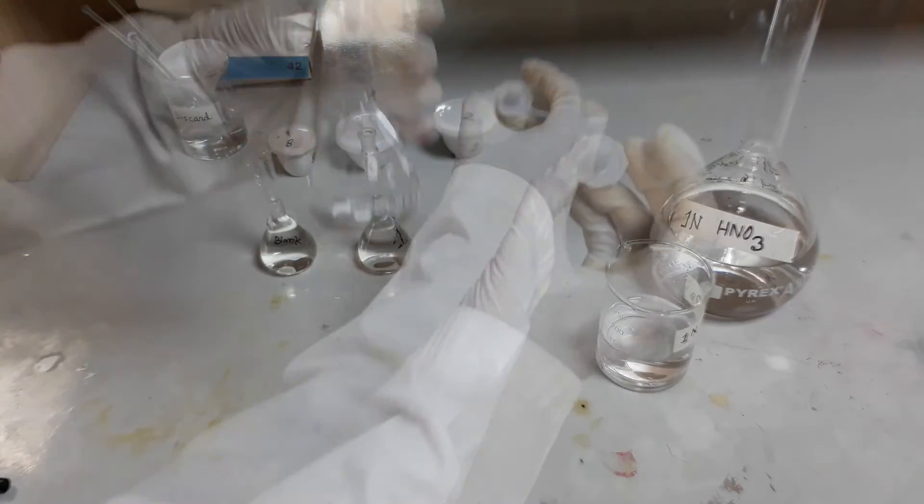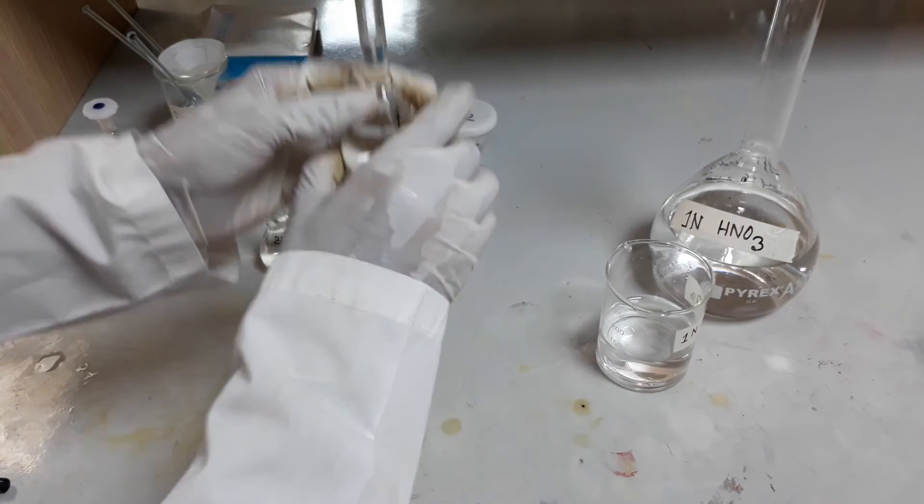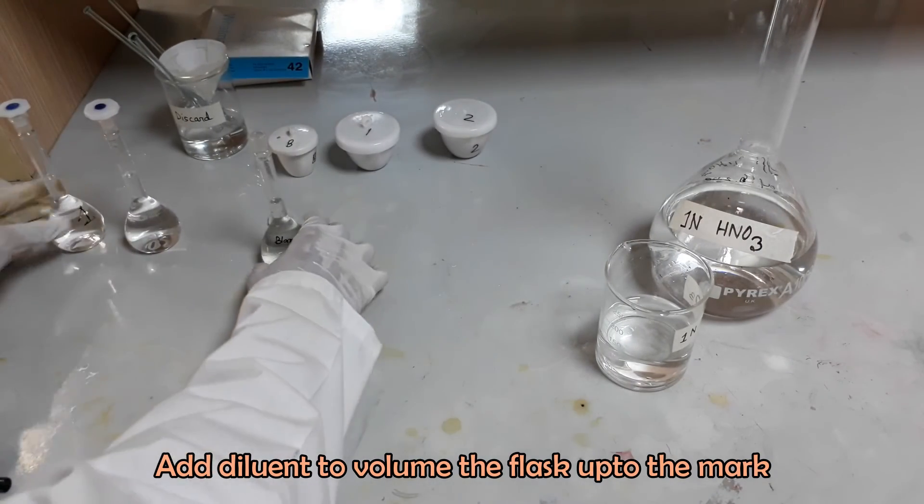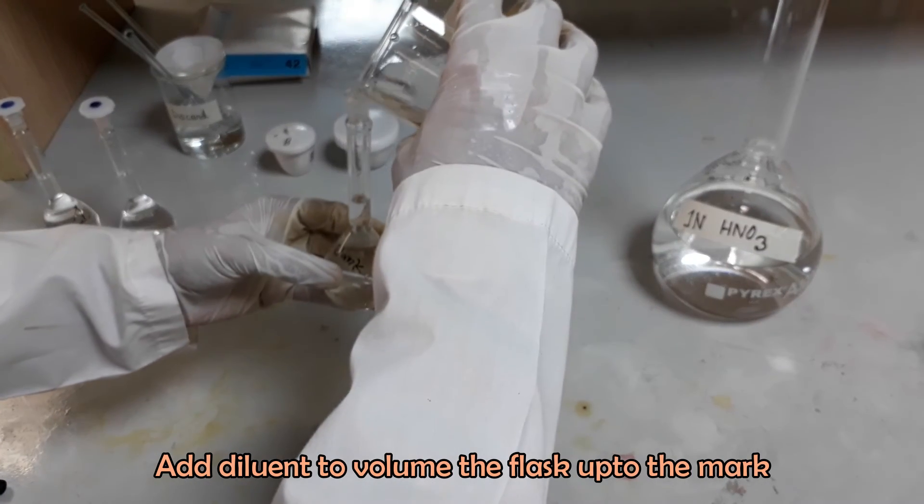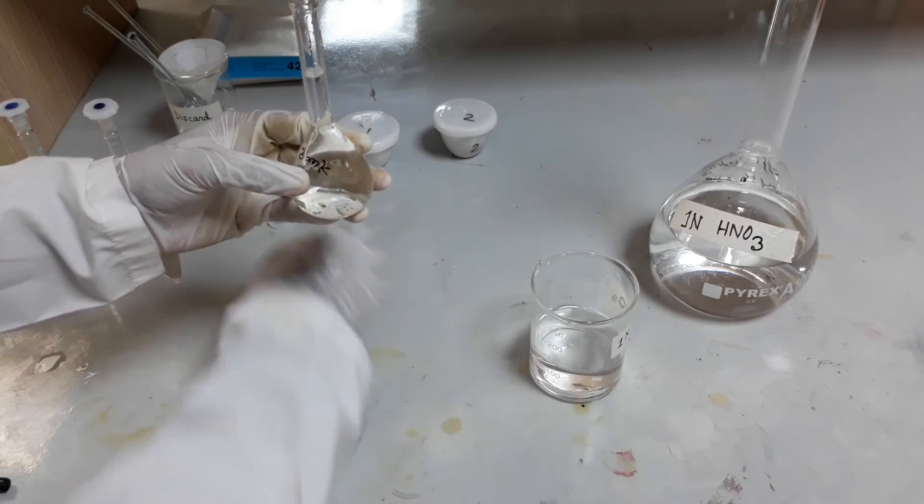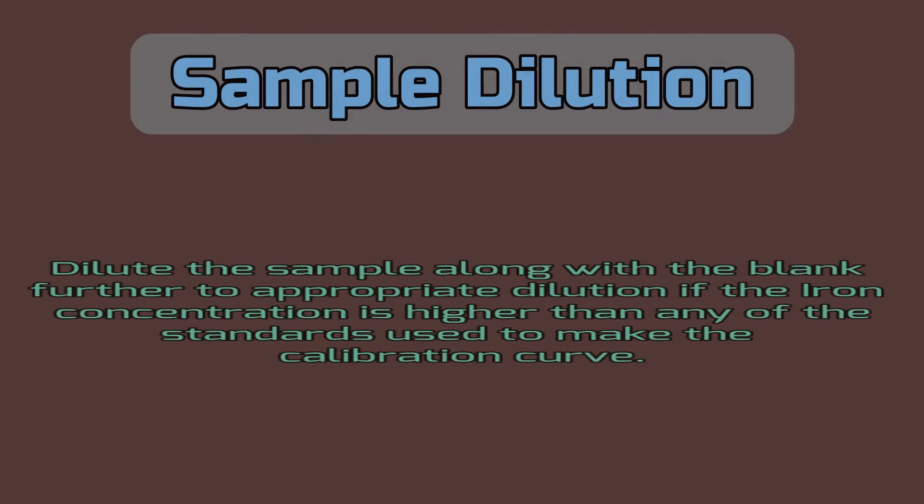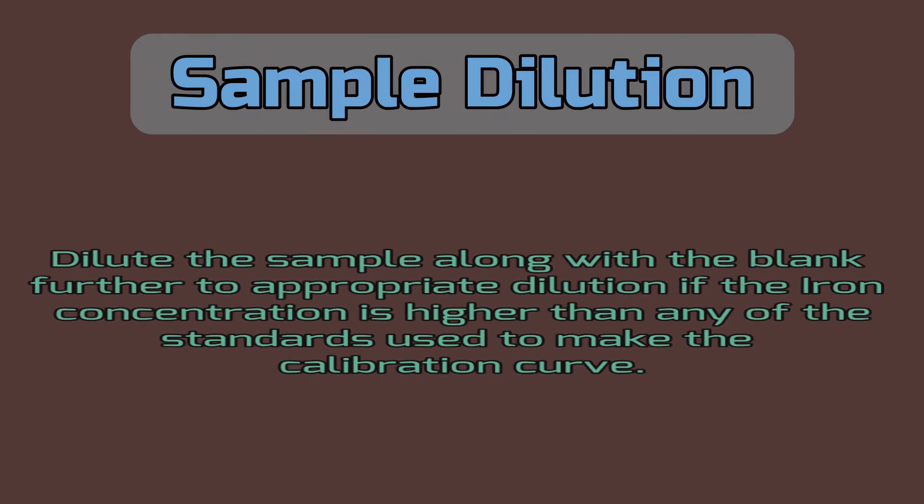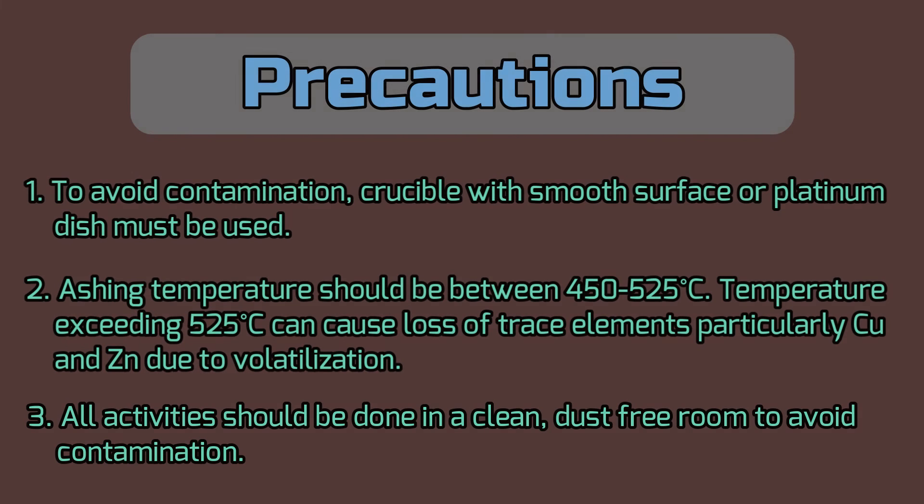Take the solution level of the volumetric flasks. Level up to the mark with diluent if needed. Our sample is now ready for analysis in AAS. Dilute the sample along with the blank if necessary to the appropriate dilution if the iron concentration is higher than any other standards used to make the calibration curve.